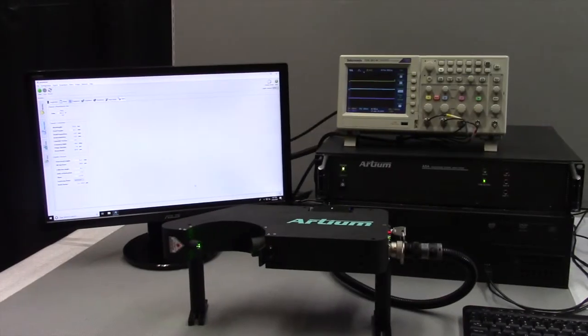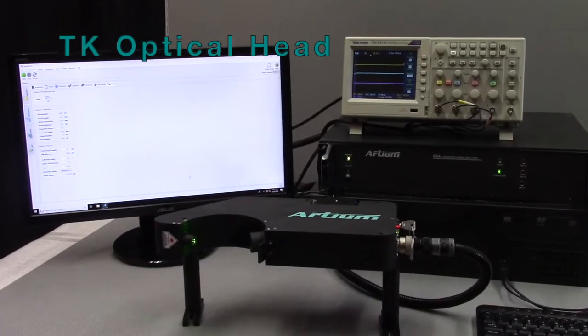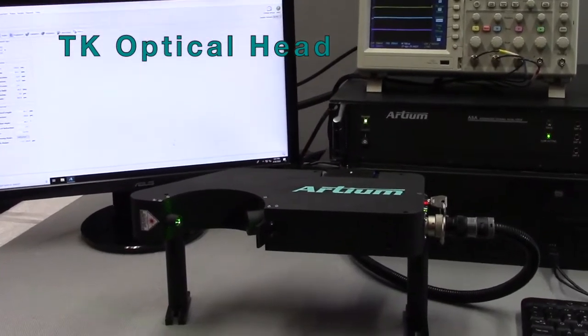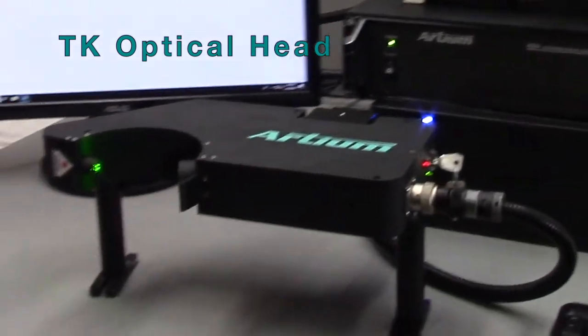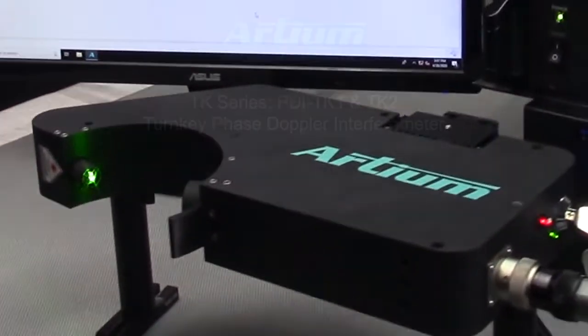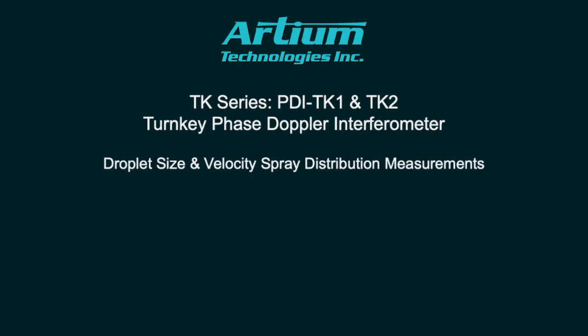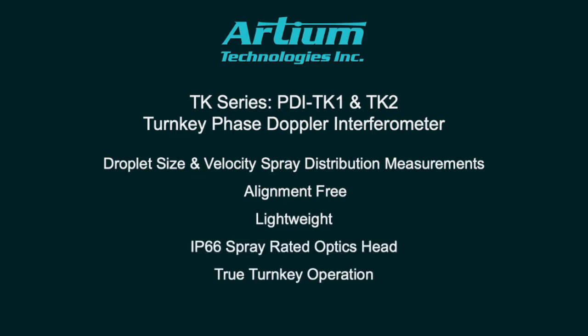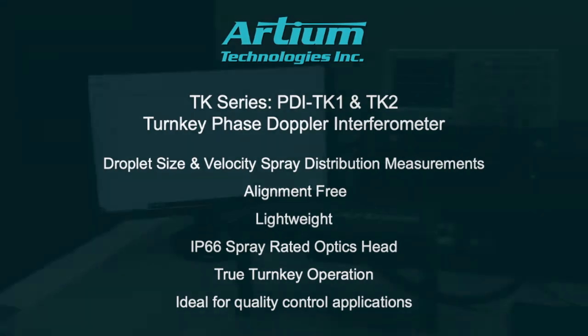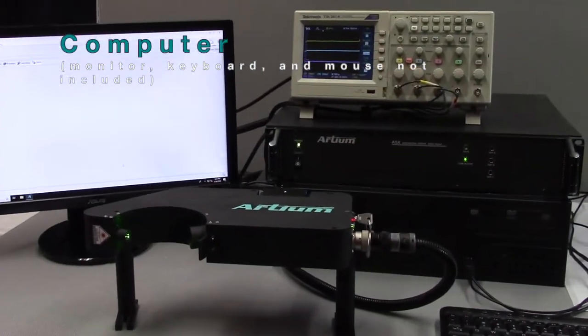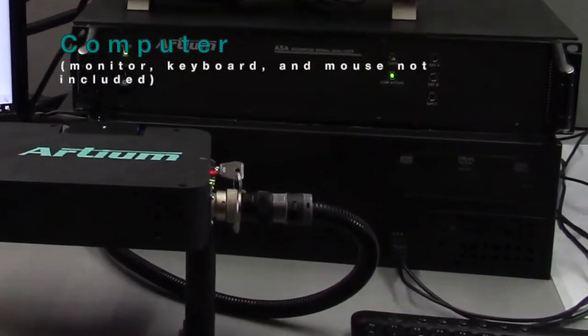So I'm going to introduce you the components of this system. We have the optical head that contains the laser sensor being the transmitter and the receiver, contained in one package. We have the computer and the monitor and the mouse and keyboard.